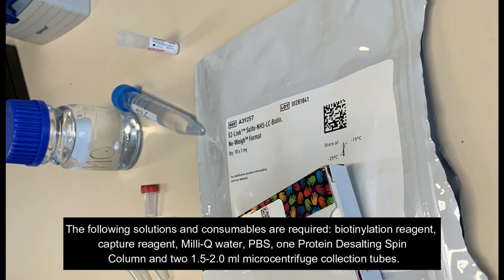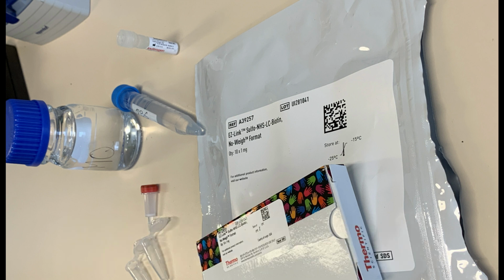The following solutions and consumables are required: biotinylation reagent, capture reagent, Milli-Q water, PBS, 1 protein desalting spin column, and 2 microcentrifuge collection tubes.